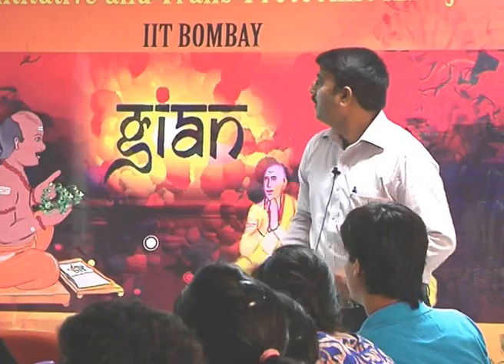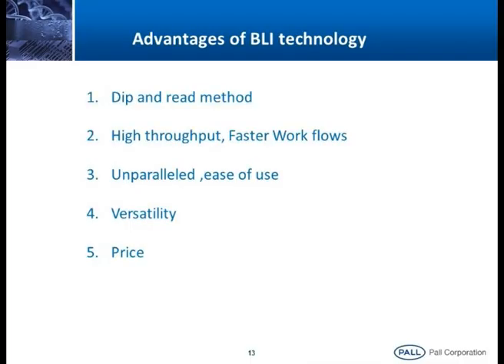So the advantage is that biolayer interferometry works on the dip and read format. Just in the 96 well plate, we have put the antigen, antibody and all that. The sensor will move like this and we can read. And the advantage is that there are no microfluidic devices.